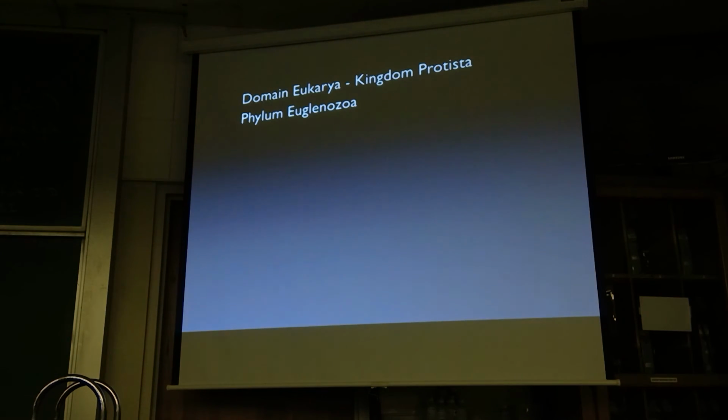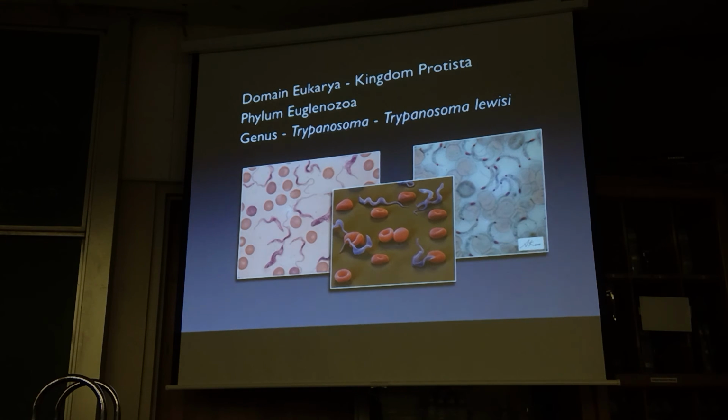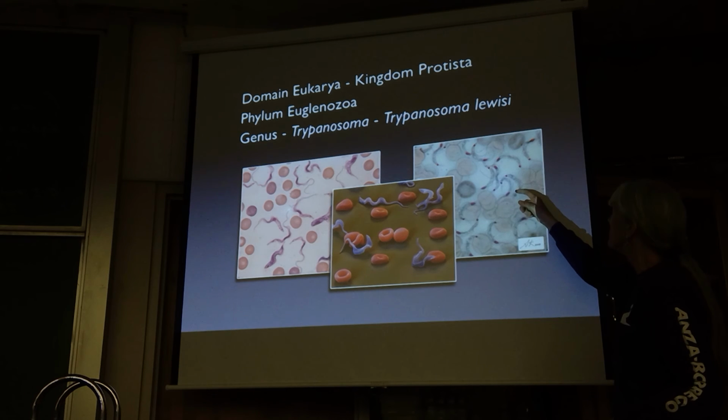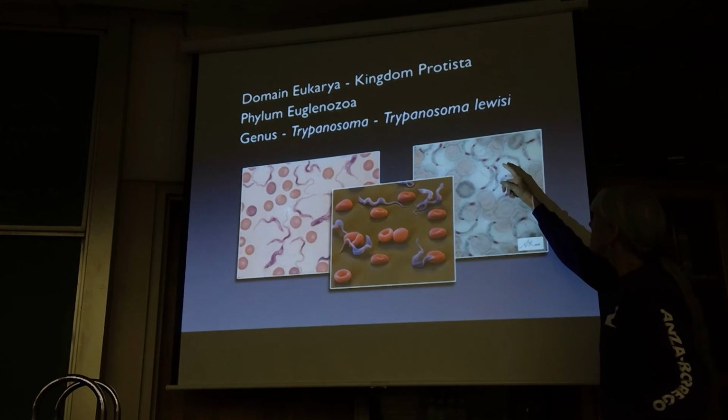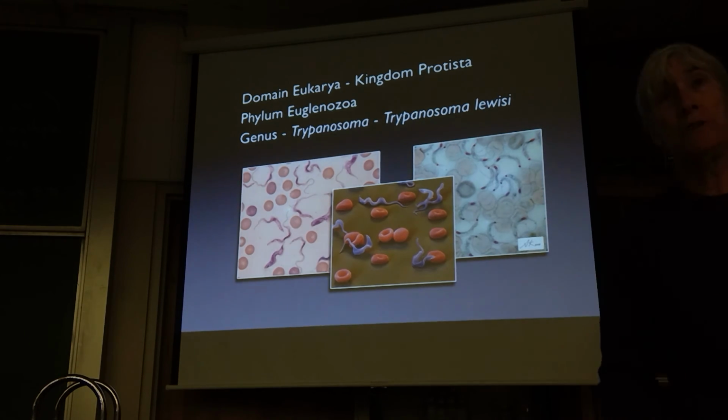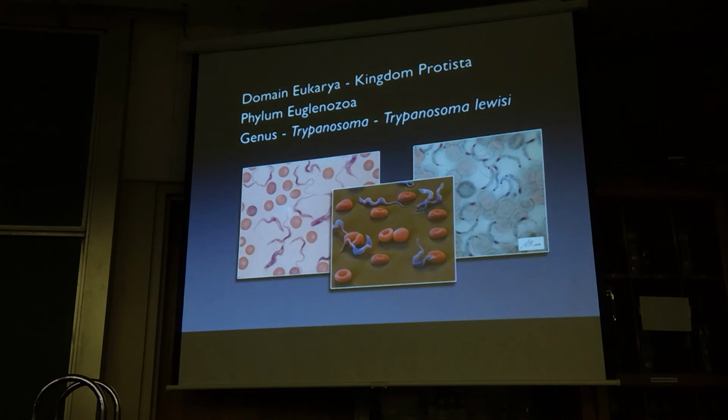And then our other example in the phylum Euglenozoa are trypanosomes. Now these images, the electron photomicrograph, the reason it's purple is because of that artificial color. These are in the bloodstream, but they're not inside the blood cells, they're between the blood cells. So here you see them. This is an actual light microscope image with the blood cells and the trypanosomes. They have a dark nucleus that's visible, and they also have that spot at one end, the pigment spot, which Euglena also have. And they have this flagellum that extends along the surface.